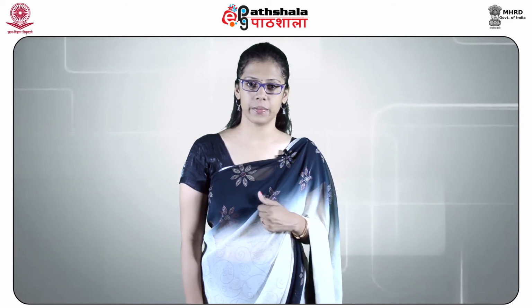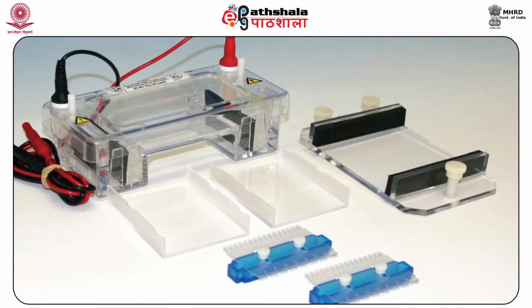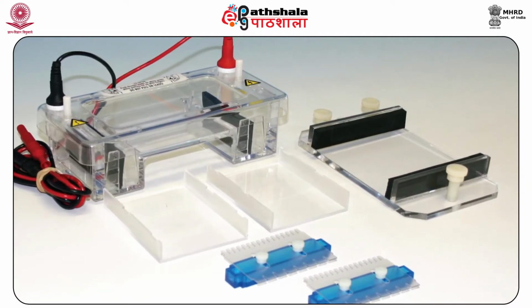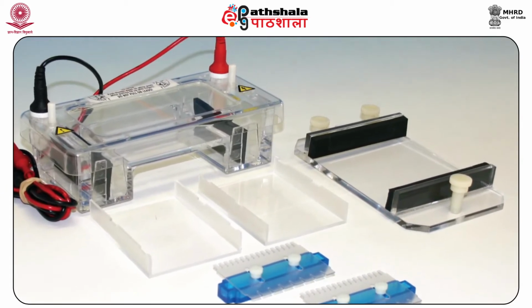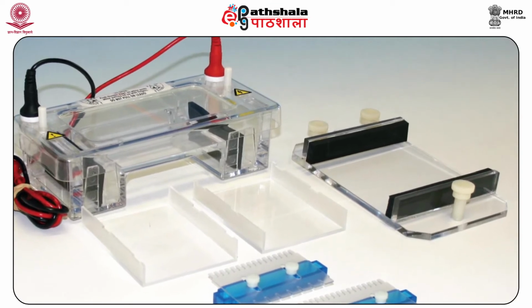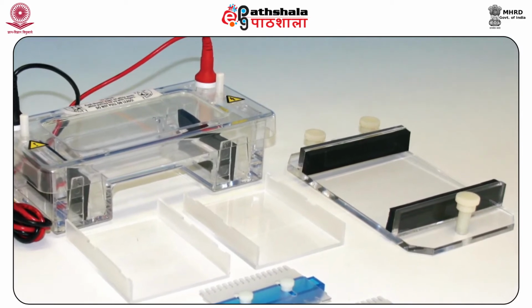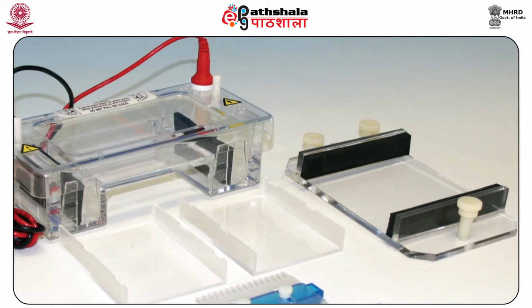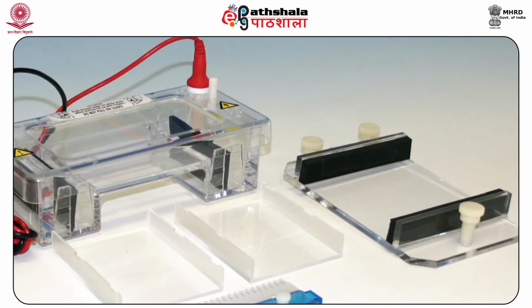An extract of suspected stain is placed in the cathode well of a gel plate and anti-P30 is placed in the anode well. Electrophoresis is commenced for 20 minutes at 200 volts, forcing the two components together. When the antigen, that is P30, meets the antibody, a precipitin band is formed. The presence of a precipitin band with an extract of unknown stain proves that the stain contains seminal fluid.